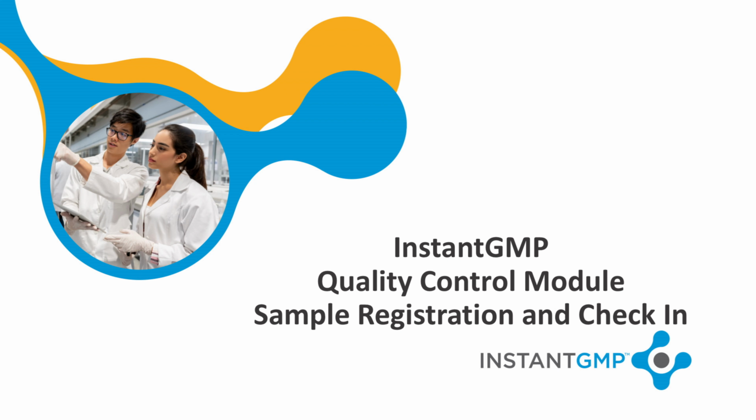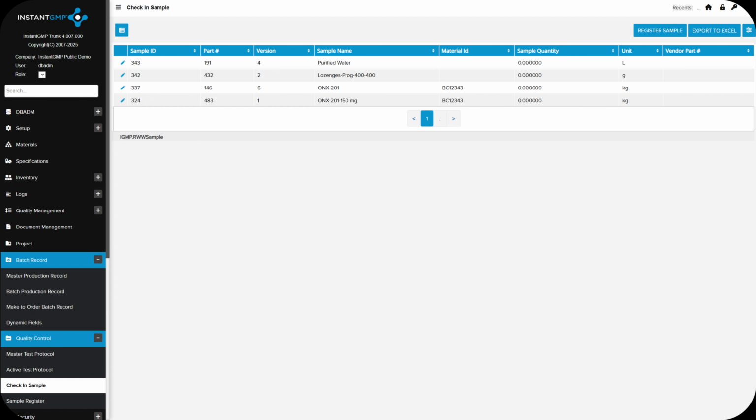This video will demonstrate the process of registering a sample and then checking in a sample, which are necessary steps to allow an analyst to start their testing. The process starts by going to the Check in Sample screen and clicking the Register Sample button.